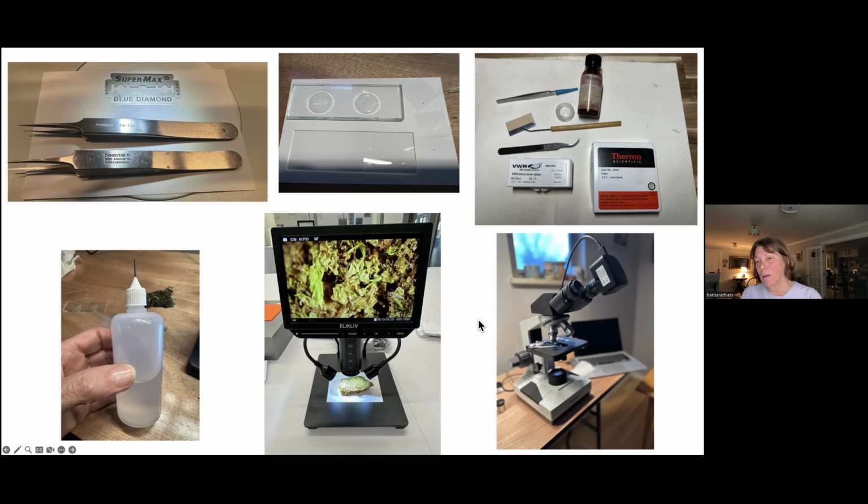Then, of course, my compound scope. I have an AmScope with a little camera on it that attaches. I can move the camera from my compound to my dissecting scope, and then see the pictures on my computer.